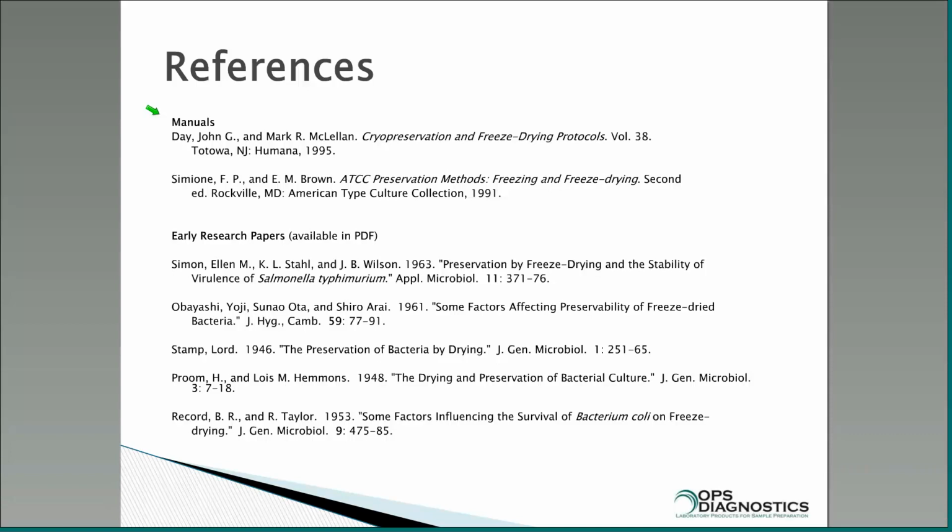That's why you saw on that one slide on freeze drying using skim milk that over time the viability really decreased rapidly because there was no lyoprotectant in there. But if you had the lyoprotectant, viability lasted for a longer time.